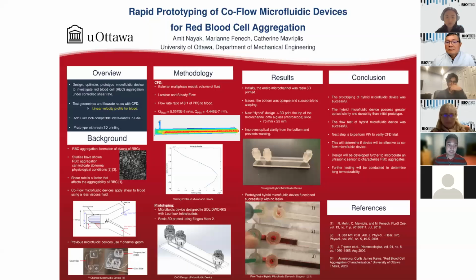The next step would be to take the CFD results and design a usable microfluidic channel in CAD, adding inlets and outlets that are compatible with current syringes. Finally, it was to prototype the actual device and test it out.